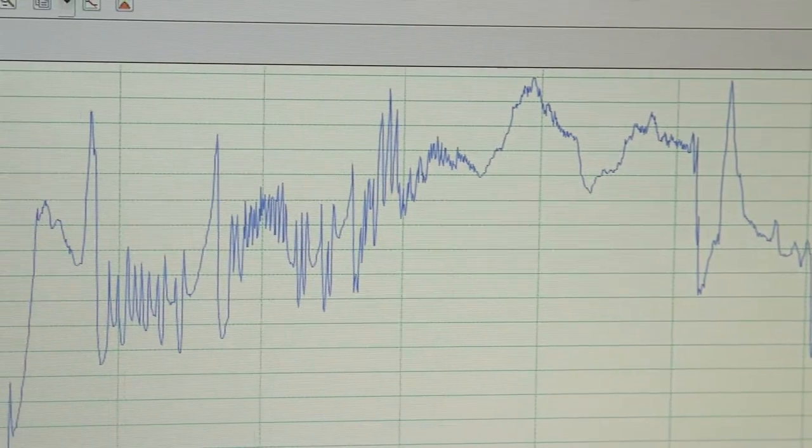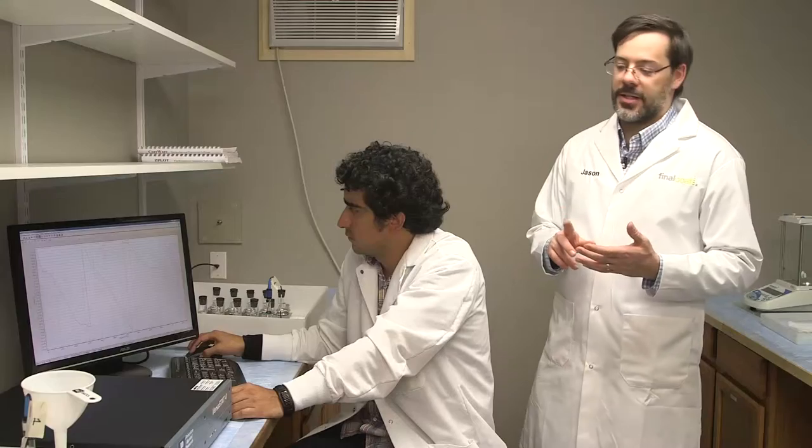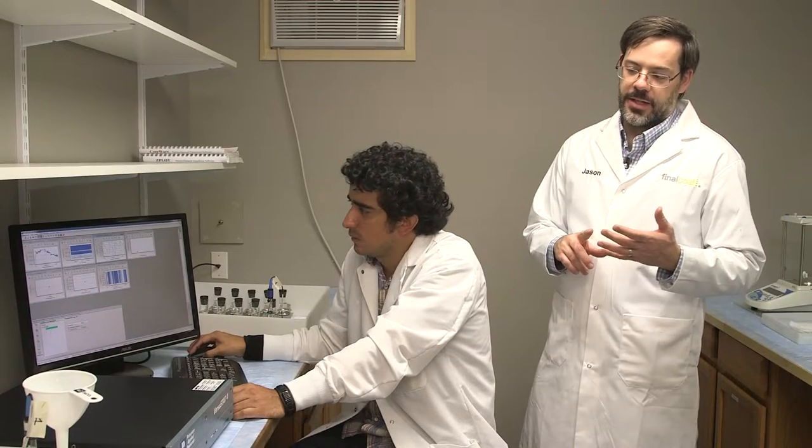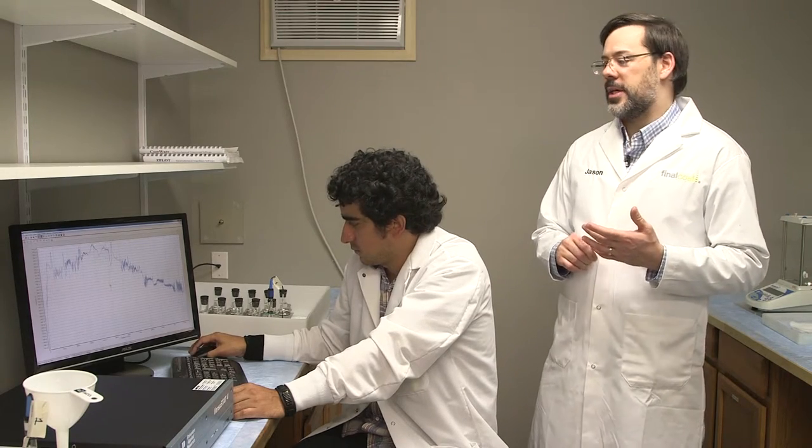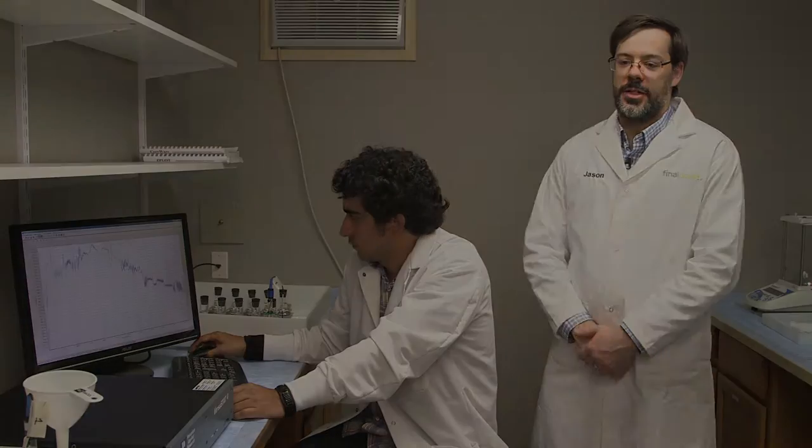One of our experiments, what we're doing right now, is confirming that zinc passivates in sodium carbonate solution. We do that by measuring the open circuit potential, and that's what's shown on the computer screen here.